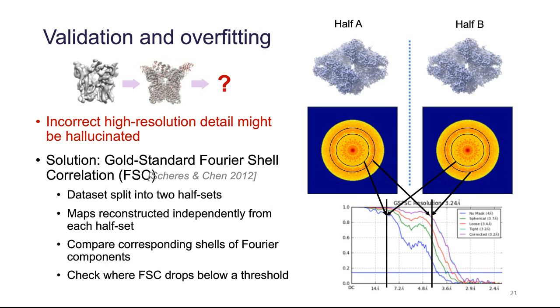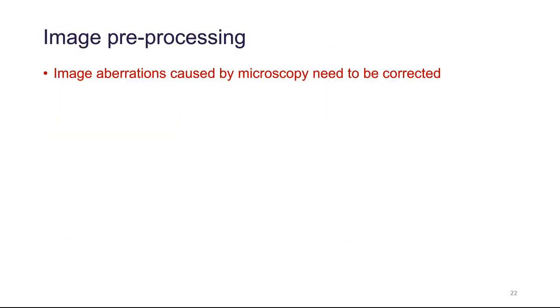Now that we've covered how 3D structures can be reconstructed, refined, and validated, I'll touch briefly on some of the advanced refinement concepts that help us obtain higher resolutions in interesting cases. One area where several recent advancements have been made is in the correction of aberrations caused in the microscope during imaging. Several groups have shown that ever smaller imaging defects can be estimated and computationally corrected.